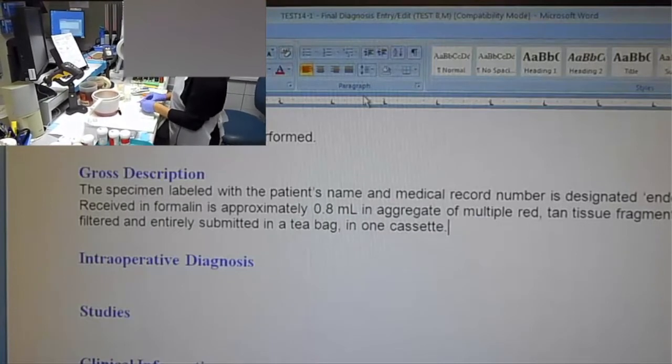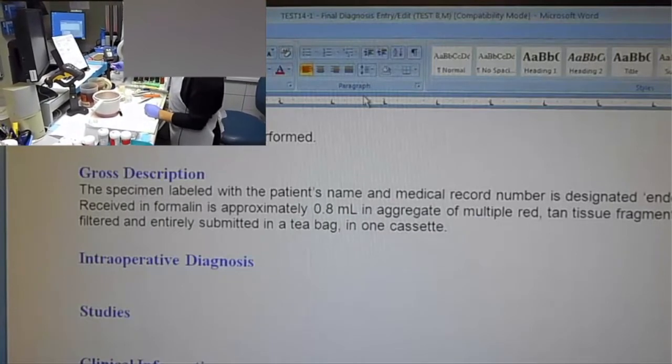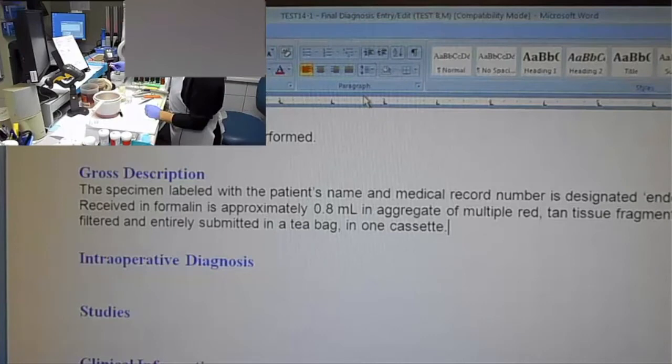And then she's going to read a canned dictation of 0.8 milliliters for an EMB specimen, and that's all going to automatically go in there when she calls the command. Then she's going to say next case, and it's going to move us into the next case.